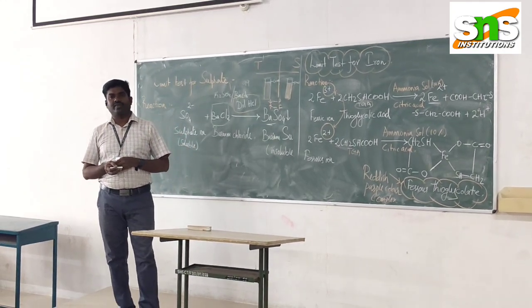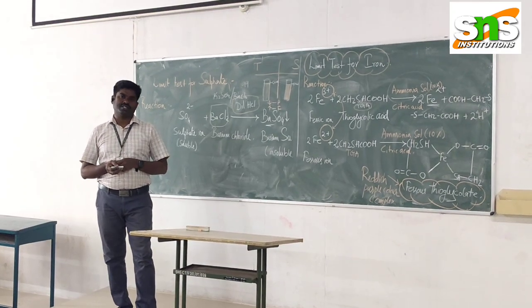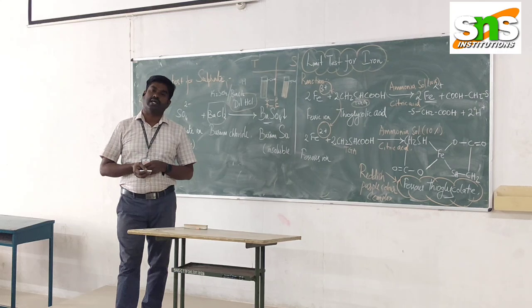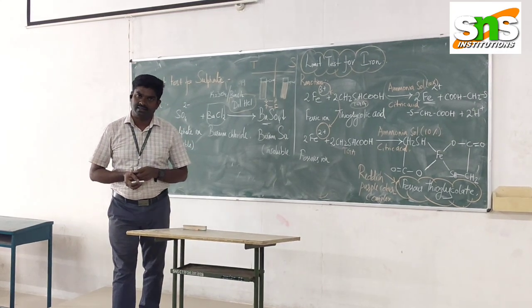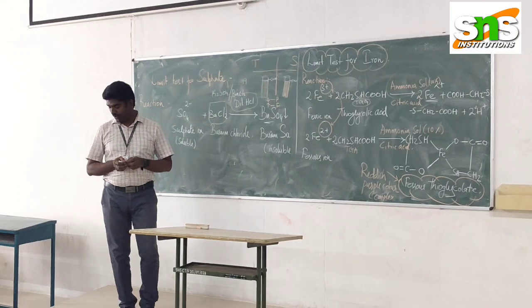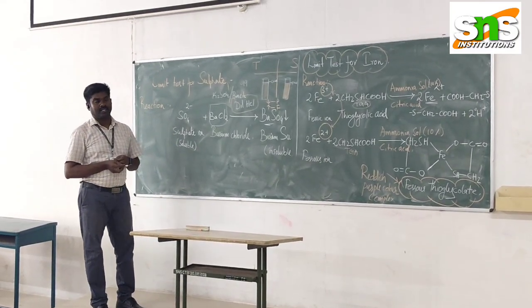Heavy metals also we can estimate with the help of suitable standards in the limit test. In this session, I am going to explain the limit test for sulfate.